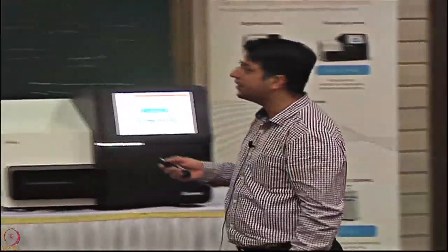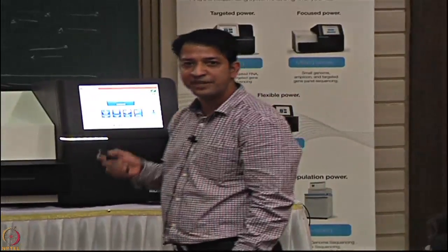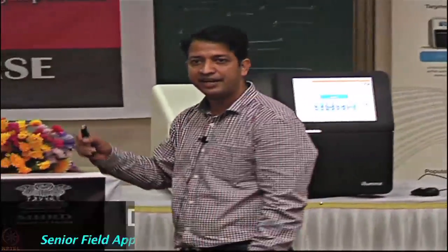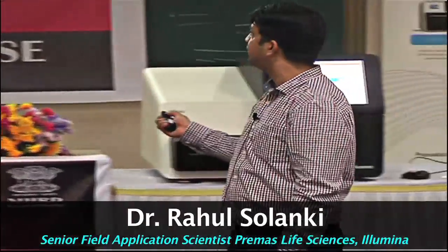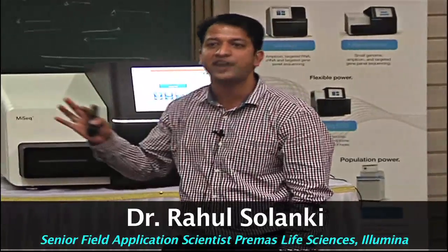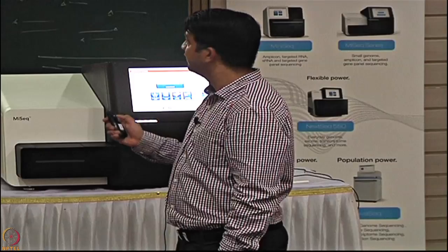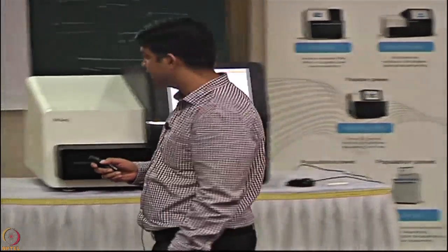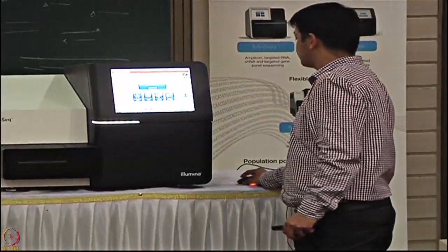What you need to understand is what primary analysis is. During primary analysis, the intensities of the base calls are extracted and you will get .bcl files on board. During secondary analysis, you will get all alignments and FASTQ files. Right. So I'll play a small video for you guys. I hope it will clarify everything. The same thing which I have shown will be shown sequentially.